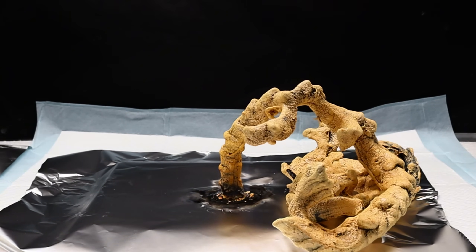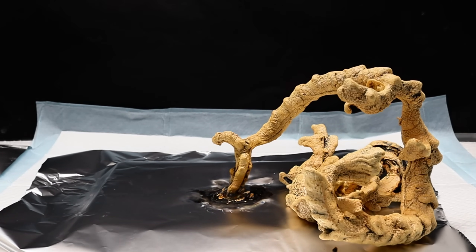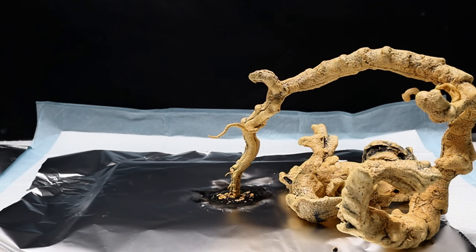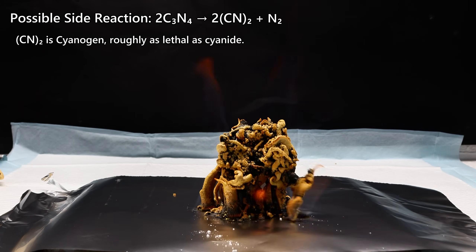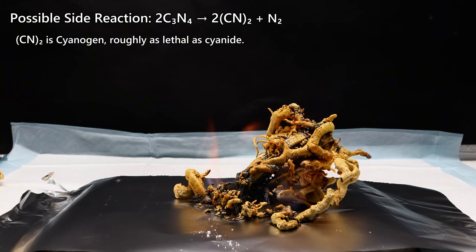With that said, extremely good ventilation is absolutely necessary here, and even in the fume hood I still wore a P100 respirator. Another possible hazard is the decomposition of carbon nitride to cyanogen gas. While it doesn't seem like this is a major reaction here, cyanogen is so deadly that I felt it worth pointing out as at least a possible concern.